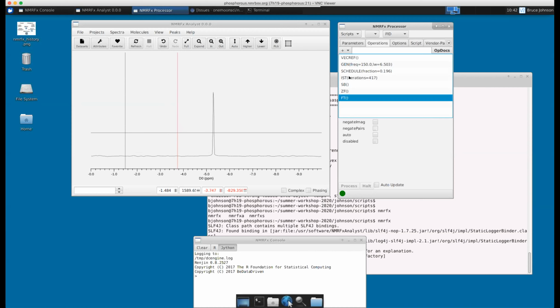To do any of these processes, you're doing many Fourier transforms. And part of the efficiency of the software, Bruce is very modest here because it's done very well, is how you manage data and how you do these transforms.